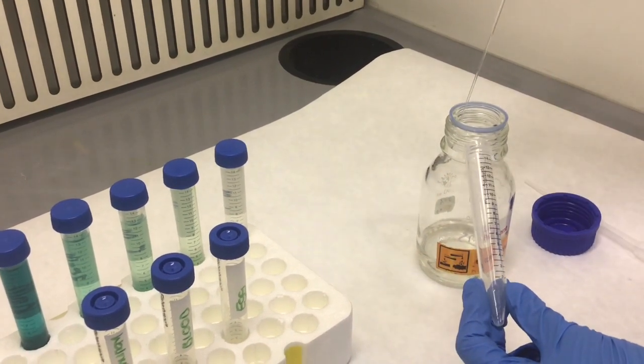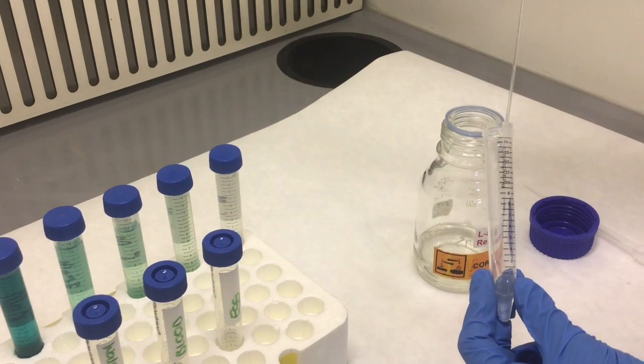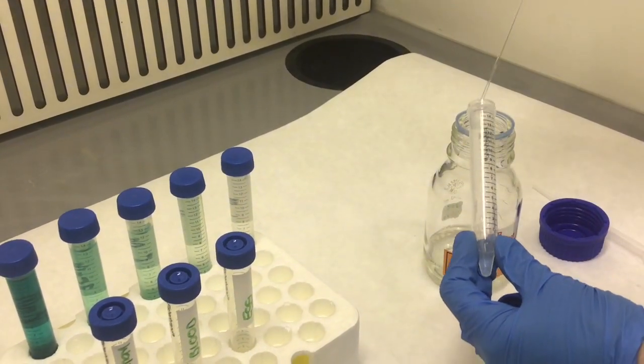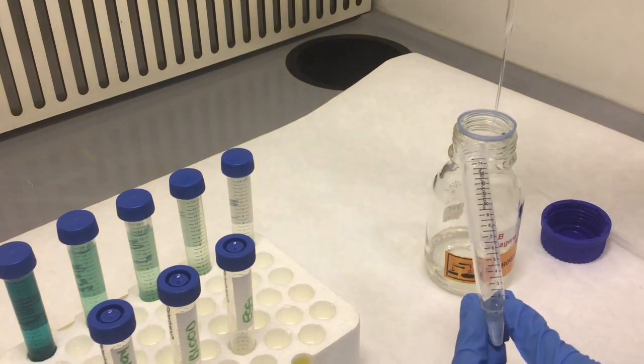Five milliliters of the Liebermann-Burchard reagent was added into a centrifuge tube. The reagent is made up of acetic acid, acetic anhydride, and sulfuric acid.